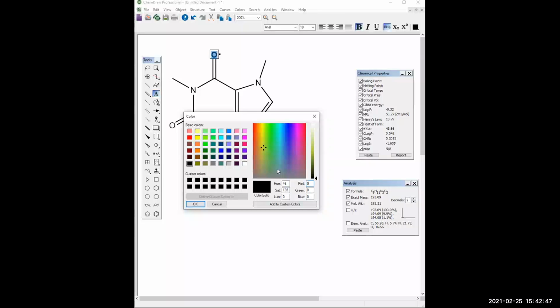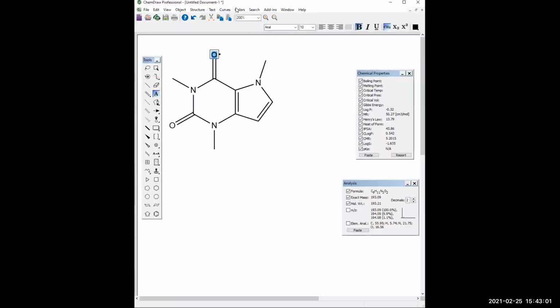I don't normally do that necessarily, but if you have a particular shading that you really like, that is an option. And you can save those under your different custom colors. But I'm going to cancel that and just use the red that they have here in our pre-selected menu.